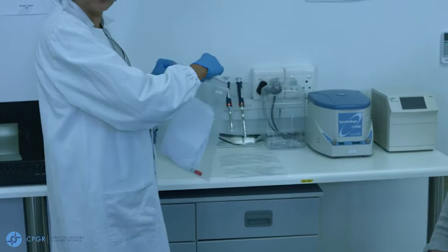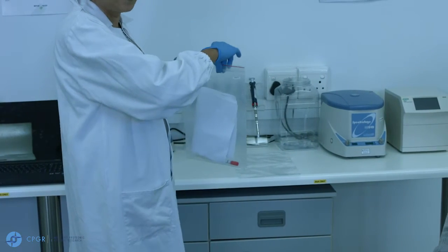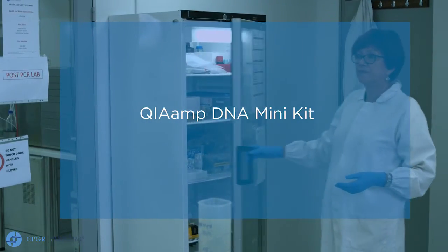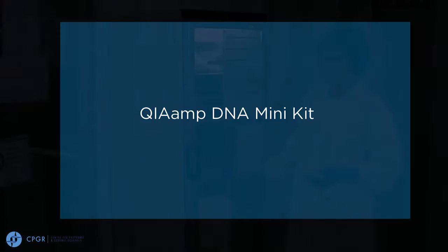To extract DNA from buccal swabs, refer to the DNA purification protocol for buccal swabs in the QIAamp DNA Mini and Blood Mini Handbook.